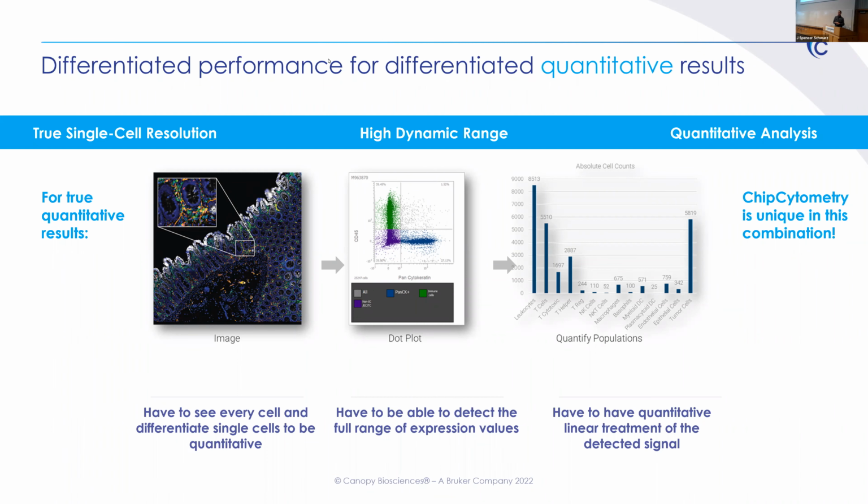One of the questions about the 4 samples: are they independently managed, are they all being run on the same panel, etc.? They can be 4 separate panels if you want. The only real limit would be if you wanted to be totally walk away, you would have to divvy up those 15 positions among the 4. But on the software side, it's independently figuring out who goes where, and it's all based on the sample.